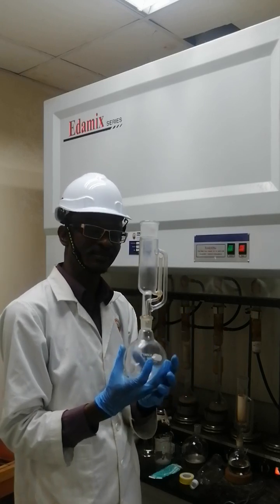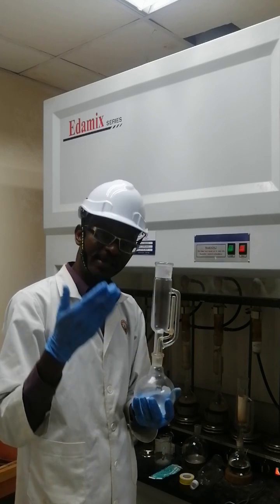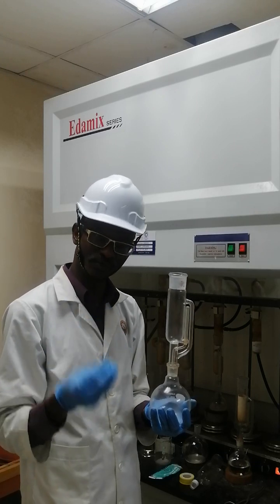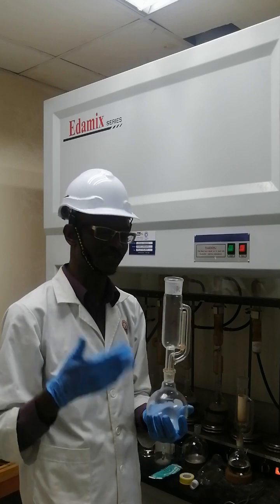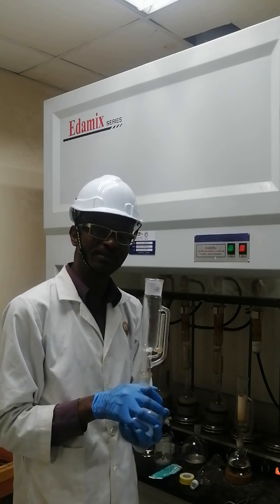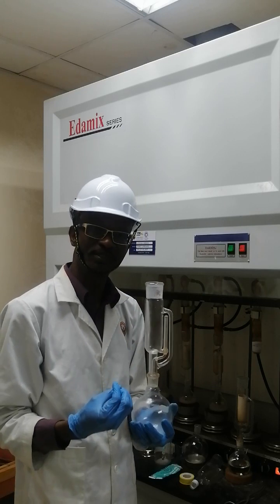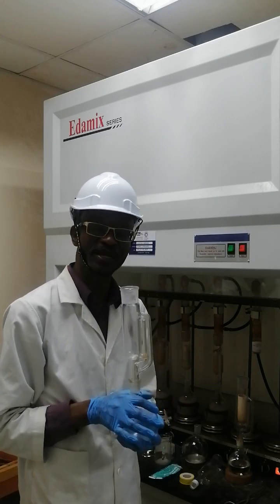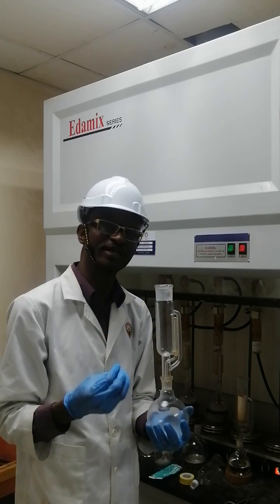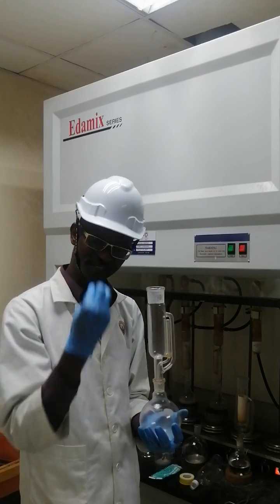And what is leaching or solid liquid extraction? It is a process where a component in a solid mixture is removed by use of a solvent. Of course, if you go into the literature, you will see the criteria by which such solvents are chosen. But the bottom line is that you use a solvent to extract a solid component from a mixture of solids. A typical example is when you leach your tea from your tea leaf. That's a typical example of solid liquid extraction or leaching. In this case, you are using water, boiled water, to remove the tea from the tea leaf.